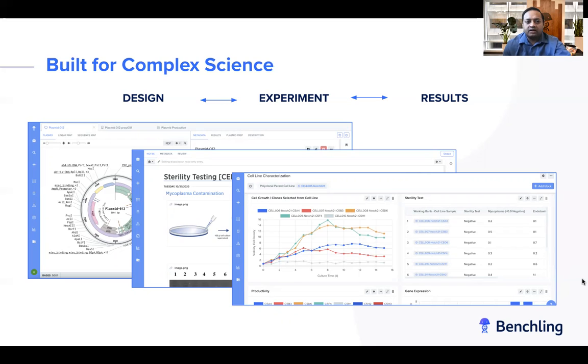And more importantly, for scientific decision support, the data can be readily queried across any dimension of the data model. This is a necessity to start building in automation and machine learning routines. So that's an example of how a very complex scientific process can be structured into a digital solution. But the hallmark of any good program is that the science will evolve over time. So what happens when things change?